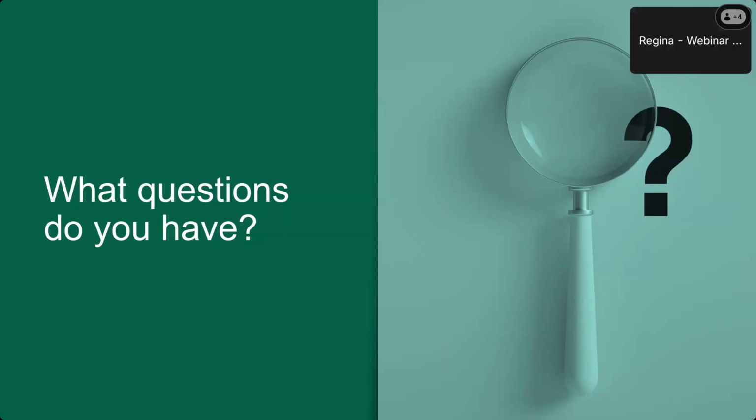All right. And Stuart looks like he may have responded to this next question. Do you have handy information? What is your blank versus MDL versus log values? That would be in the application note, that information on our MDL and our blanks. That was kind of in that spider plot that I had there, but the application notes that are linked at the end of the presentation also include some of that information.